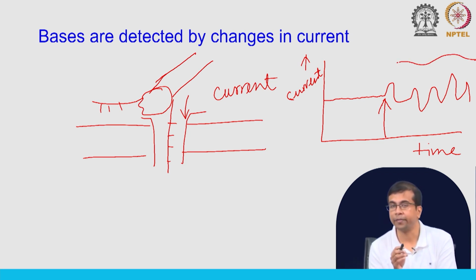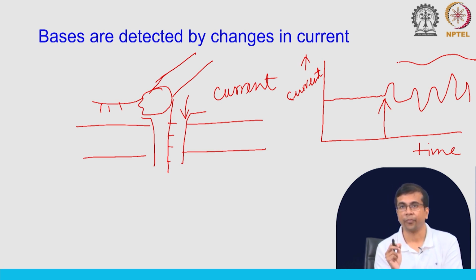Okay, and there is a specific characteristic of this specific set of sequences that will induce certain changes in the current. Okay. Now, as you can probably imagine, this is quite a difficult process, right. So, identifying which bases are passing through the nanopore from the current signal.